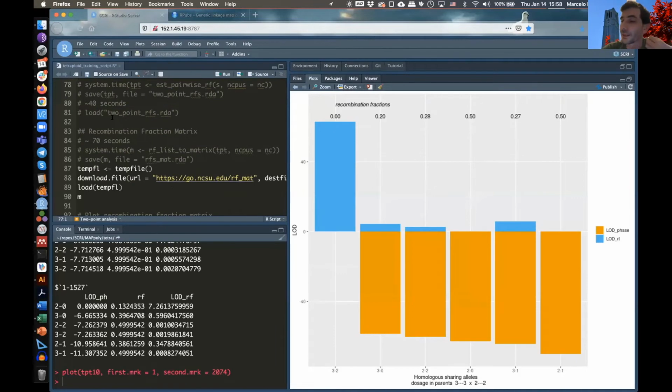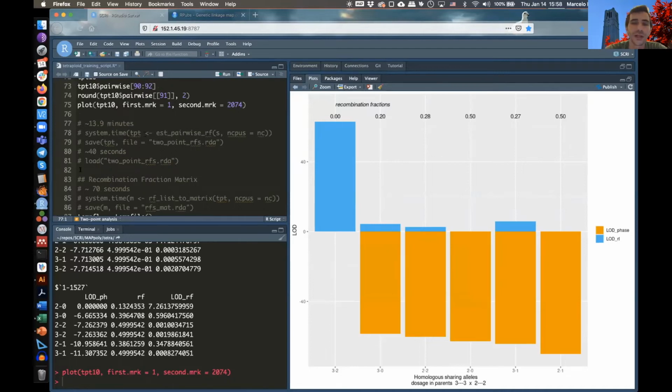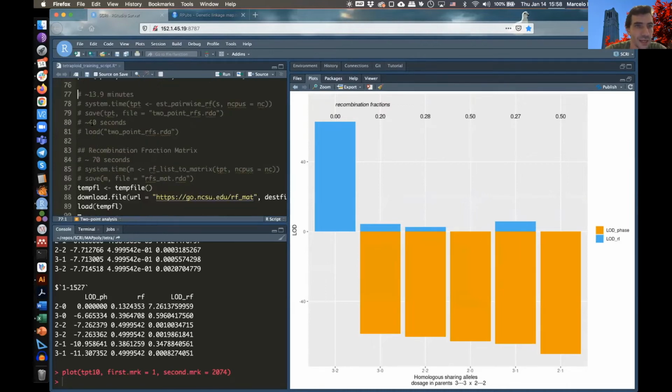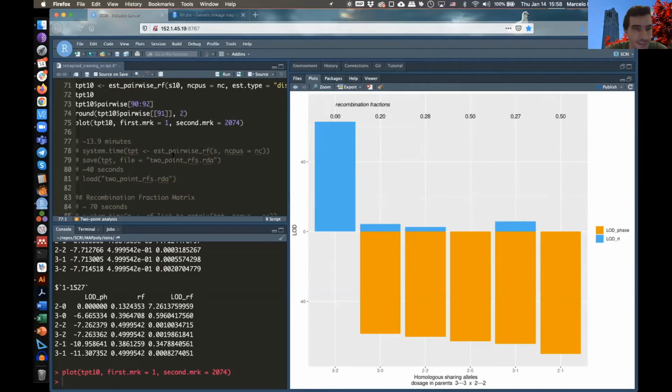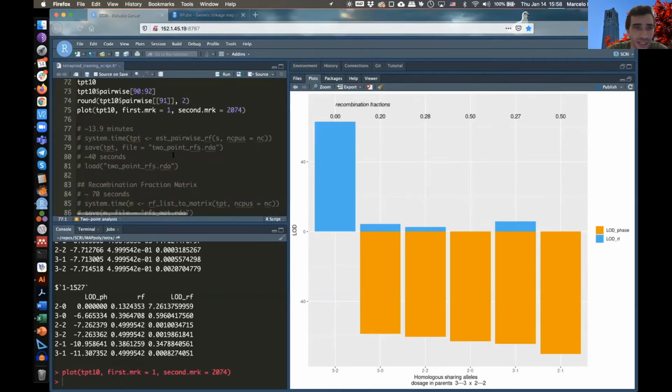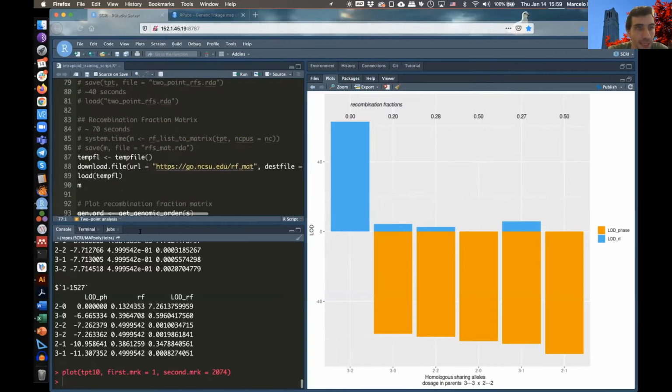As I said to you, I did this just for chromosome number 10. But in reality, what we want to do is to compute this recombination frequency between all markers in your data set. And you can do this using this syntax here. So instead of using chromosome, we use the whole data set, as we defined it before. And the result for that is actually a list.